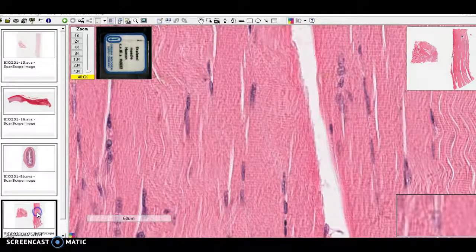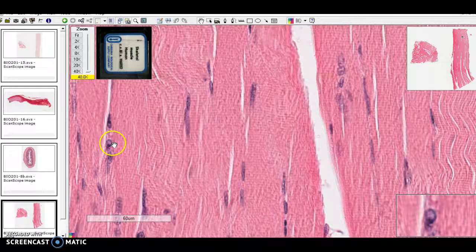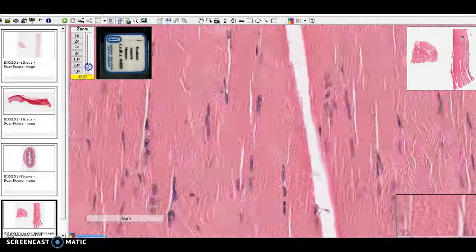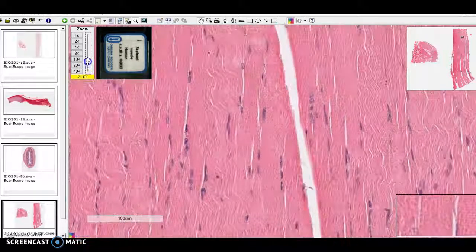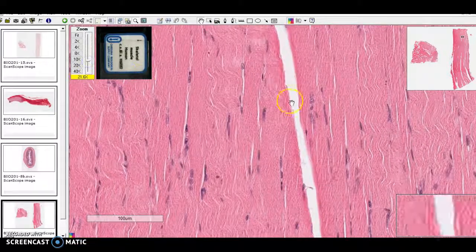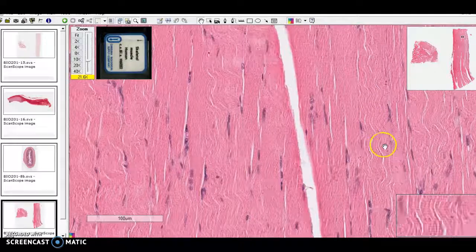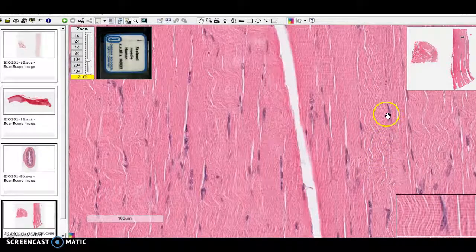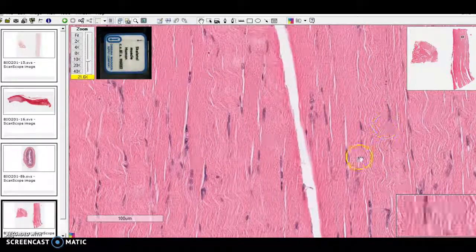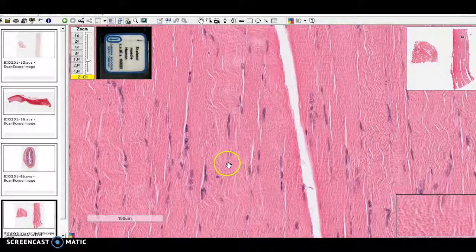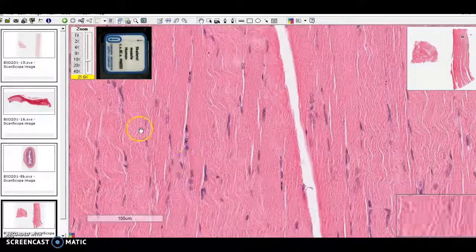So skeletal muscle has a similar look. And if we move out a little bit, oh, it's wavy if they didn't pull it tight before they took their section.